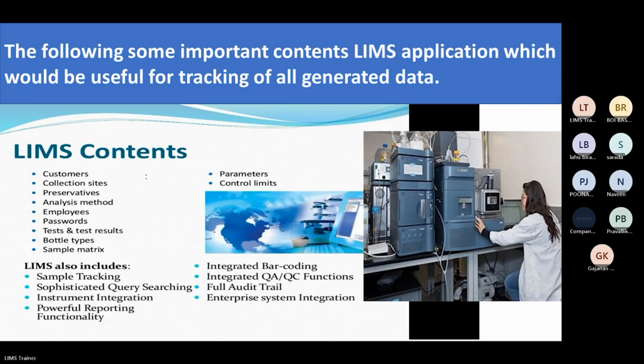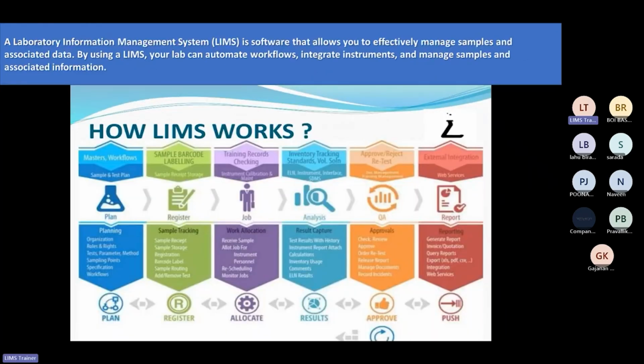Then the workflow: how actually the workflow happens in the software. See, the first thing is the plan. The planning of that particular analysis will happen. After this, the registration of the sample. The sample is required to be registered into the software.